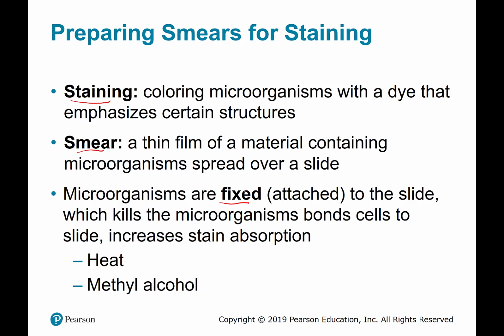And there are different ways to fix the organism onto the slide. You can use heat. You can also use alcohol. And with either one of those, you're going to denature surface proteins that allow them to stick to the slide.